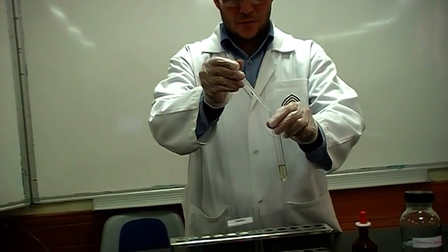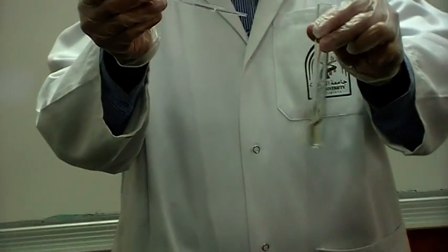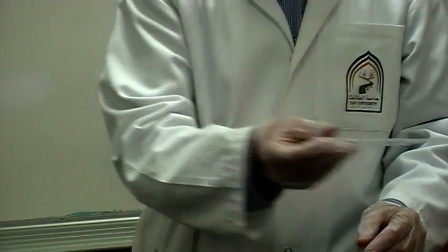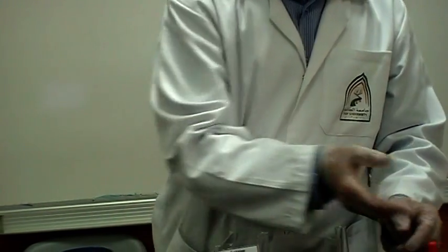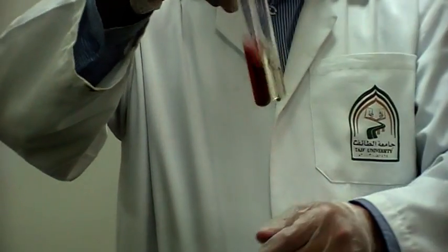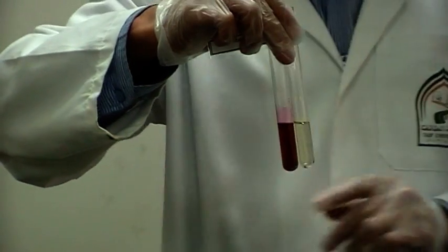Let's use the control. What's the control? No change. I'm comparing with the control. Can you see the difference? It's very very obvious.